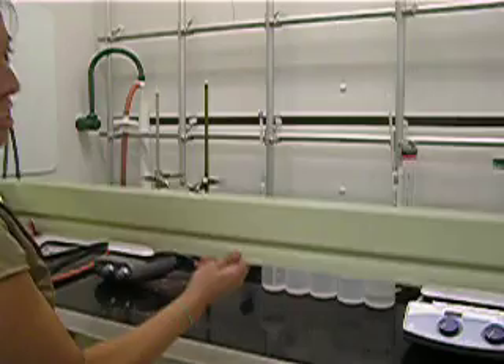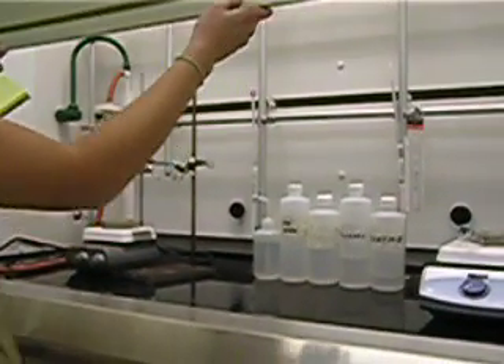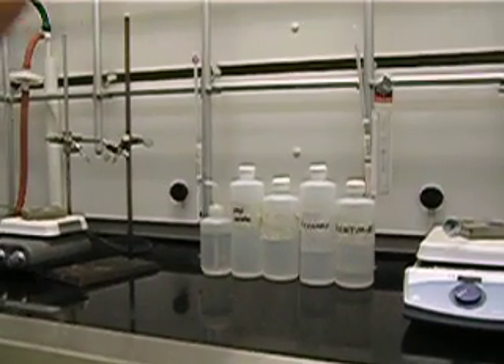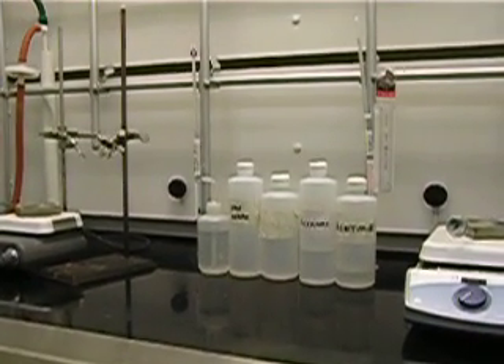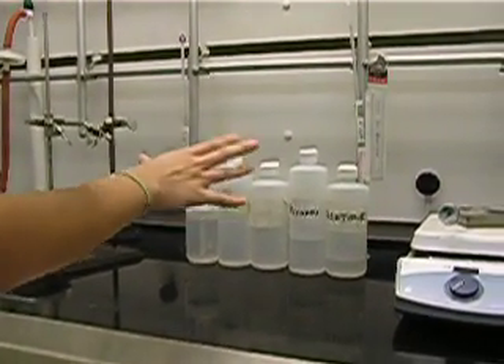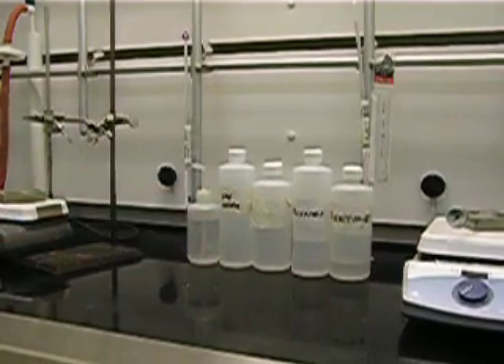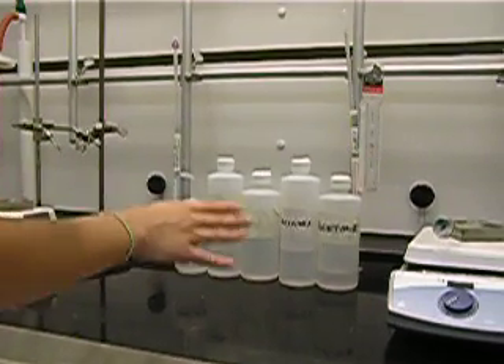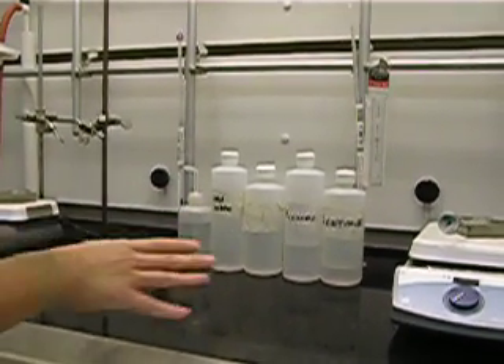You're going to open the hood sash to the safe sash level, which is about here. The alarm won't go off if you keep it at that height. The solvent will be in the middle for you to share with your partner. You can also get refills at the prep hood, which we'll be discussing later.